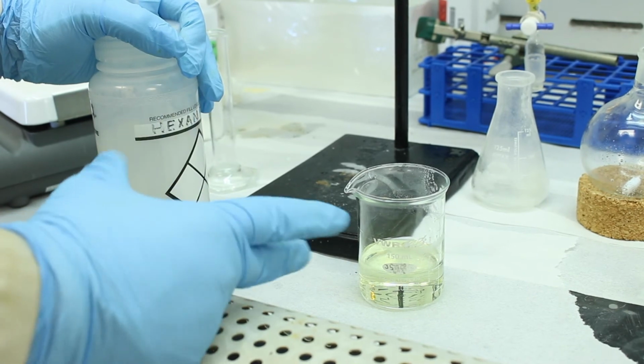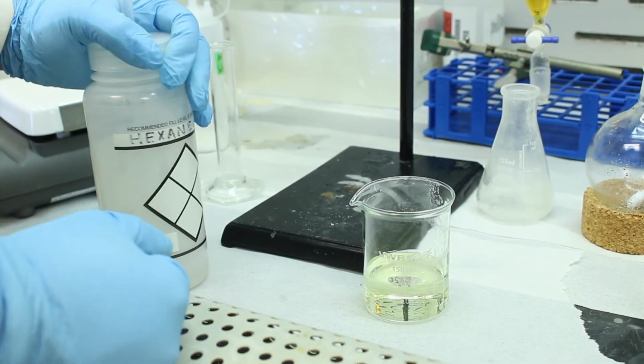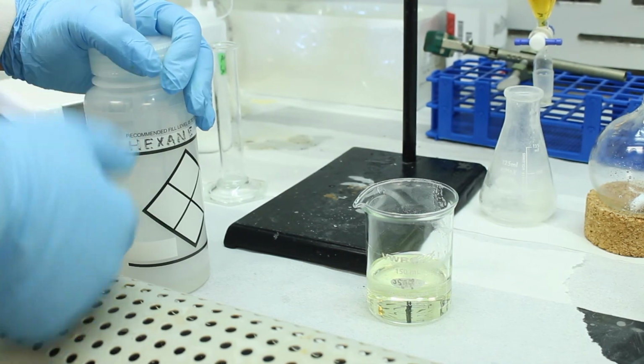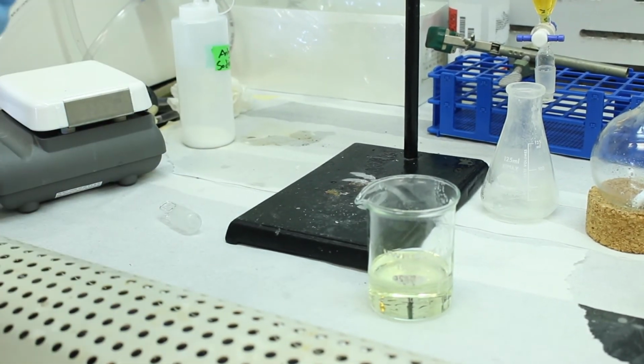One way to do it is to take the crude solid and wash it with the solvent that will get rid of the impurity, in this case hexane. But the other technique is you can simply make a mixture of the two solvents and then start to boil it down. So we're going to add about 10 mLs of hexane here.